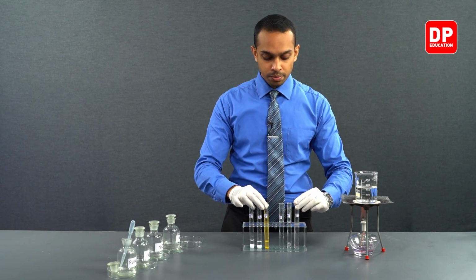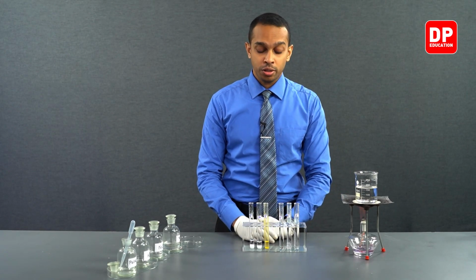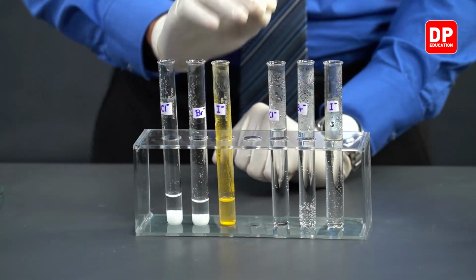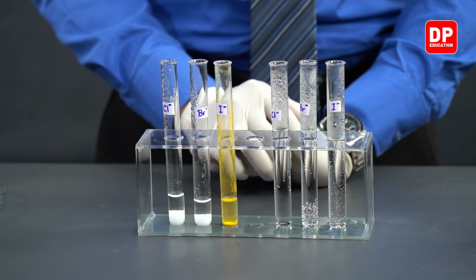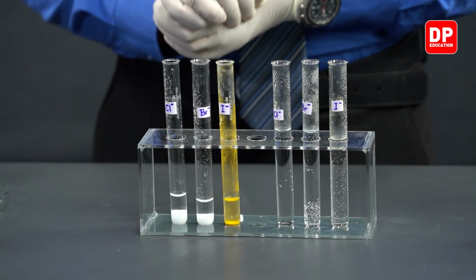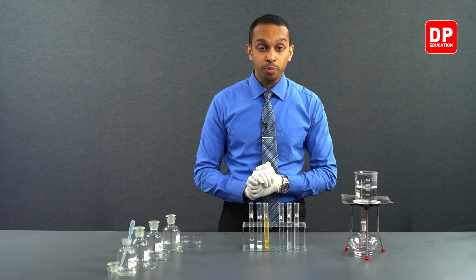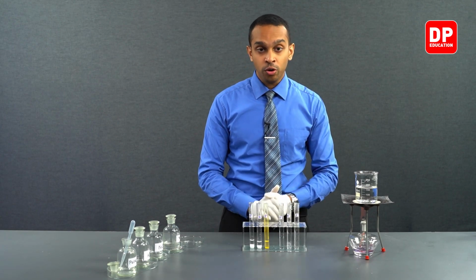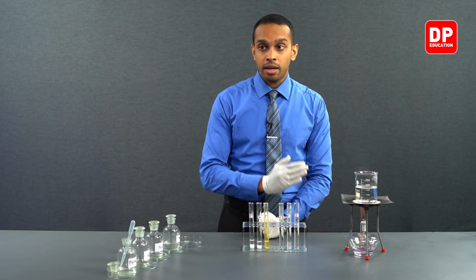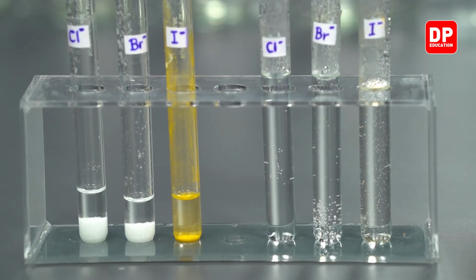So now, since we have shown that in hot water all three halides of lead can dissolve, we will give it some time to cool down. We want to see upon cooling whether these precipitates will be reformed. So we will wait for another few minutes and observe the formation of the precipitates of lead chloride, lead bromide, and lead iodide upon cooling these hot solutions.